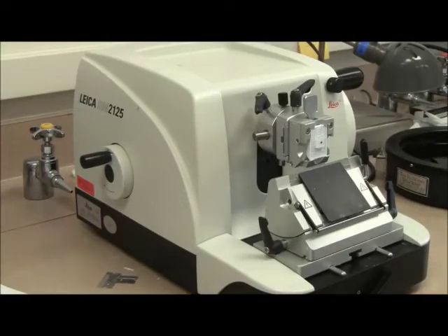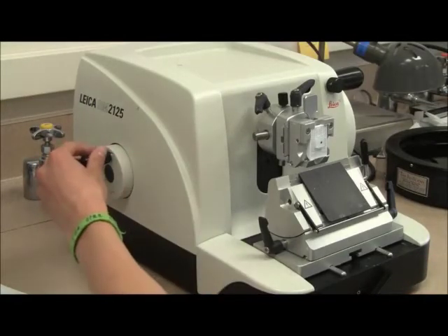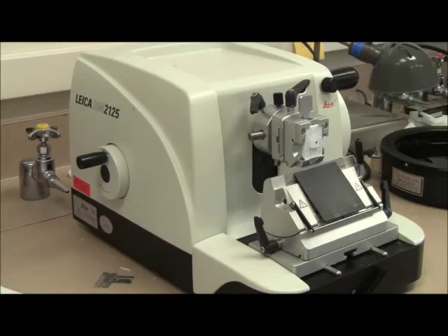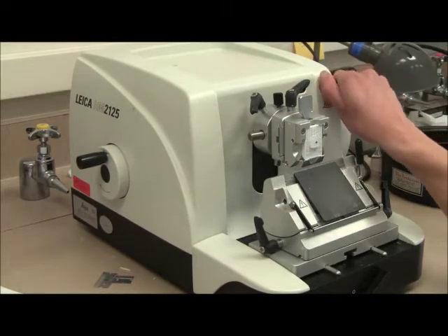This can also be accomplished by using the coarse feed wheel. Set the thickness indicator to 10 micrometers and begin cranking the hand wheel.